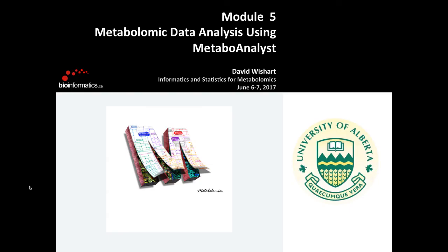So we'll try and have a sound and light and fireworks show just to keep this MetaboAnalyst module engaging. I think Jeff's done a really nice job of introducing statistics to you, and a lot of what MetaboAnalyst is about is trying to use the statistical tools that you've just learned about, but to make them very easy to handle and very easy to use, basically pointing and clicking.